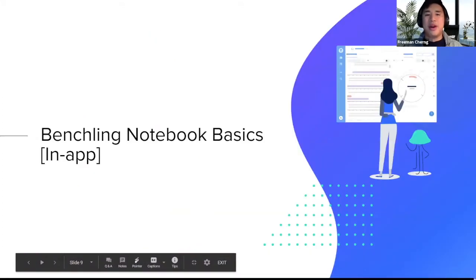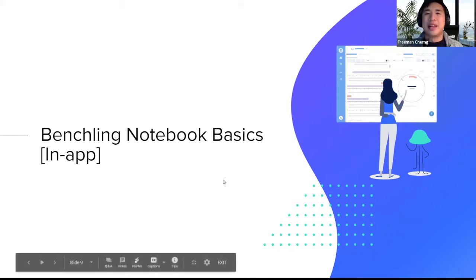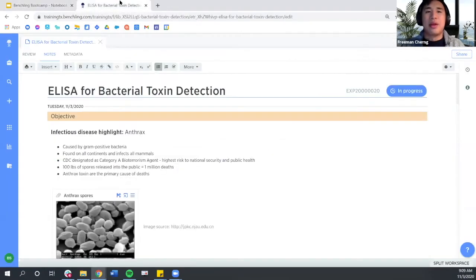Great, so now that we've gone over the concepts behind the Benchling Notebook, I'm going to leave the slides for a bit and dive in platform for our demo to see how we can leverage the notebook to support all aspects of data capture. So as a cloud-based platform, I don't need to download any desktop applications, and I can immediately navigate to Benchling by opening a new tab in my web browser.